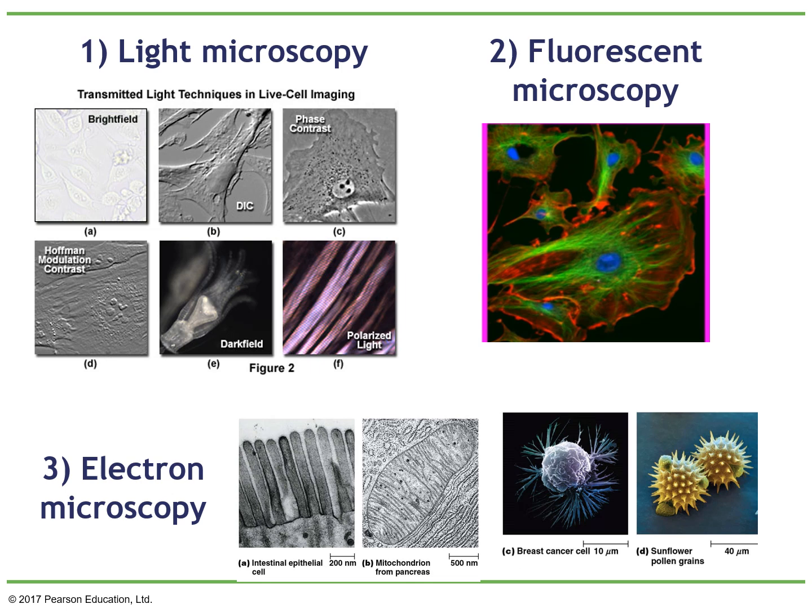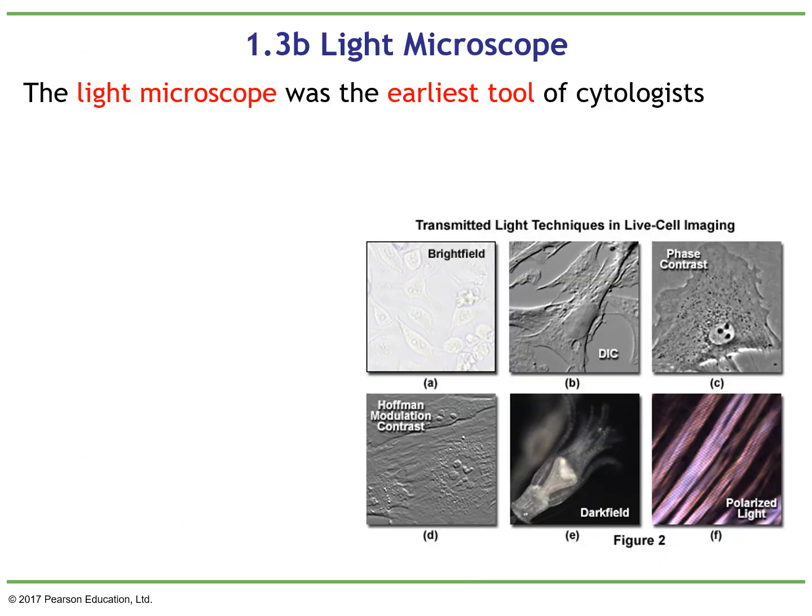While in the first one we were using white light, visible light, in the second one we were using this process of fluorescence. In the last one, we have a much higher resolution because we are not using light or fluorescence. We're using electrons to make those pictures, okay? So they give us a much higher resolution. Okay, so let's start.